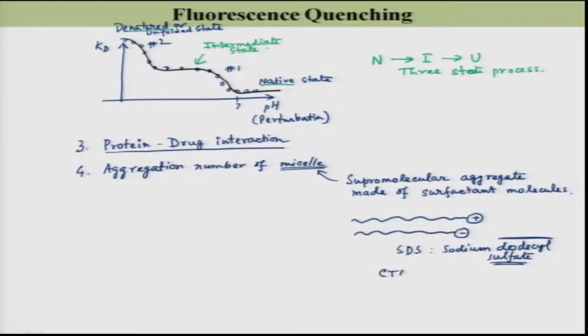Similarly, CTAB, cetyl trimethyl ammonium bromide. So, here is my positive head group and here is the long chain, right.